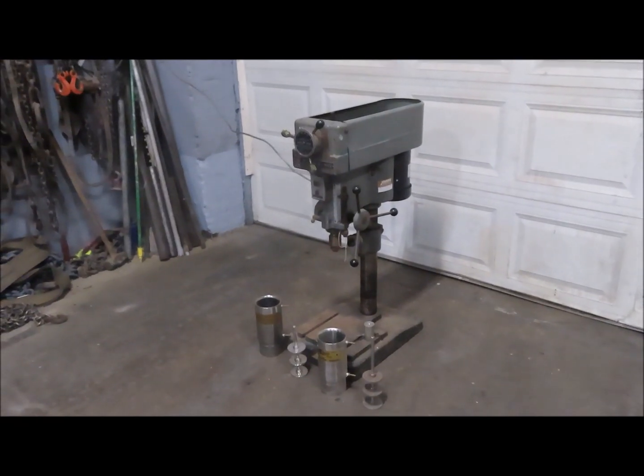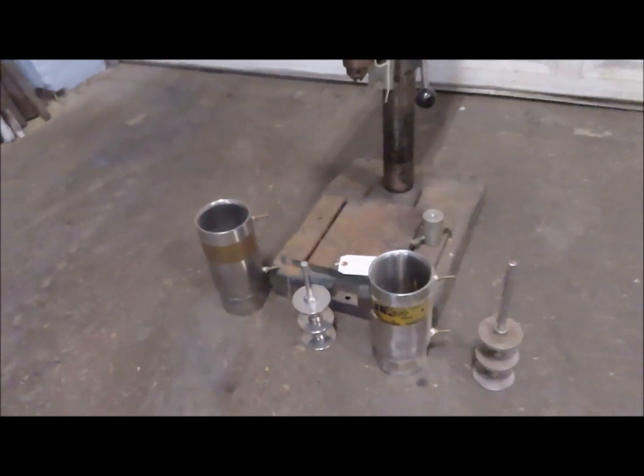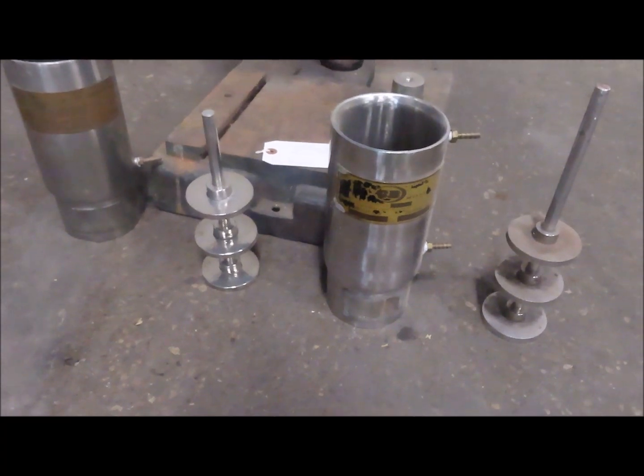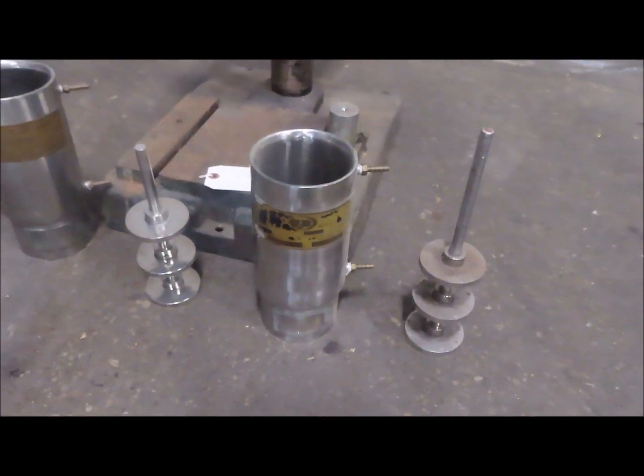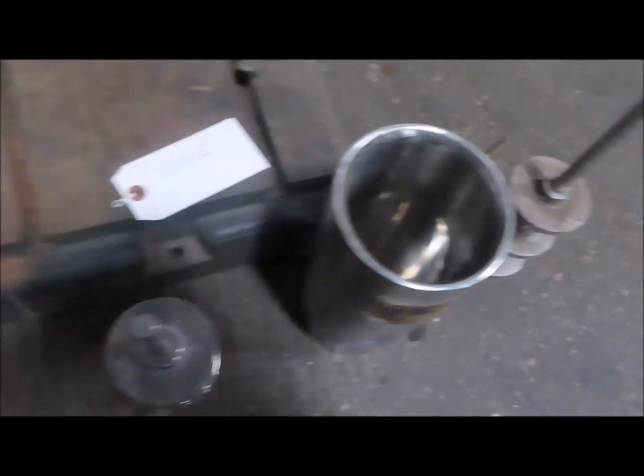It's a laboratory sand mill. It's got two Chicago boiler chambers that are stainless steel and jacketed. It's got two shafts with rotors, all in good condition.